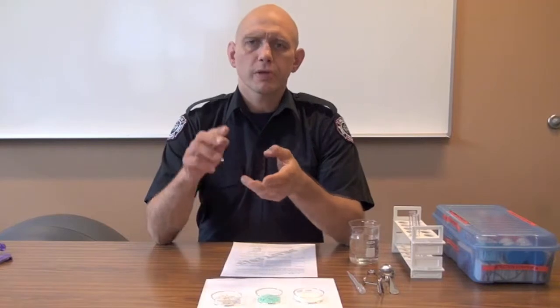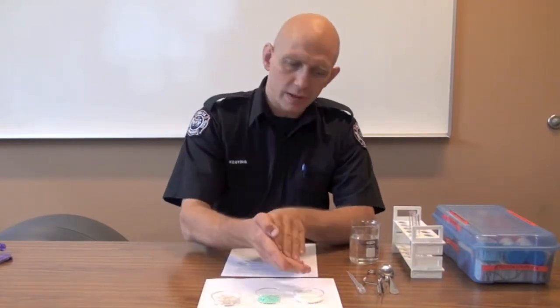So we've done our signs and symptoms, we've gone and done our initial recce, we've brought back a small sample — in this case, three small samples of the solid product.